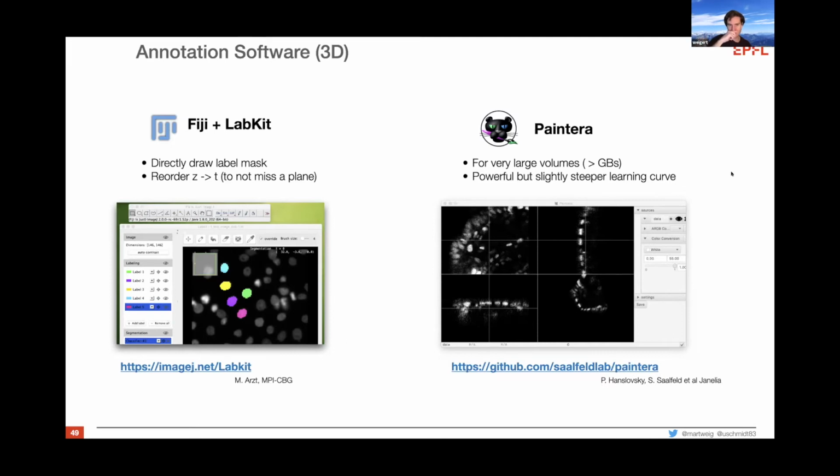Yes. Okay. So another thing, sorry, about the 2D or 3D segmentation. You mentioned the pain of annotating 3D data. I recently took a course about deep learning in 3D image segmentation, and a lot of people there actually took the approach of using 2D nets and then finding clever ways of combining the output of those into 3D, just because it's much easier to get annotated data. Do you have a comparison between StarDist 2D applied to 3D images along different axes and your 3D StarDist models? So we haven't done that, and it's very interesting.